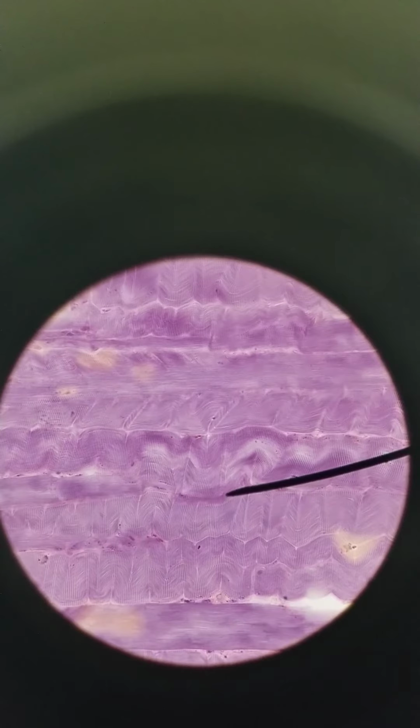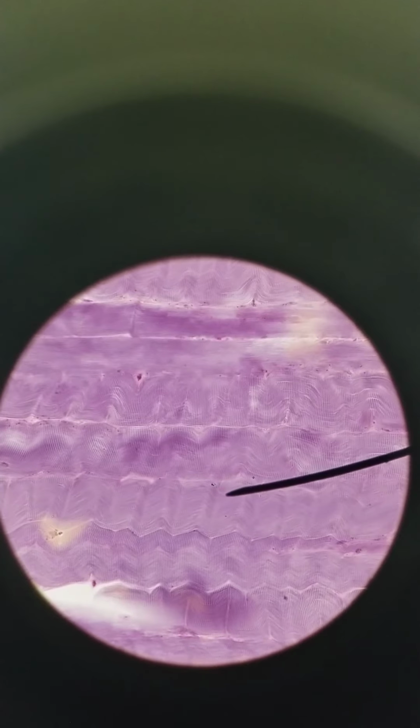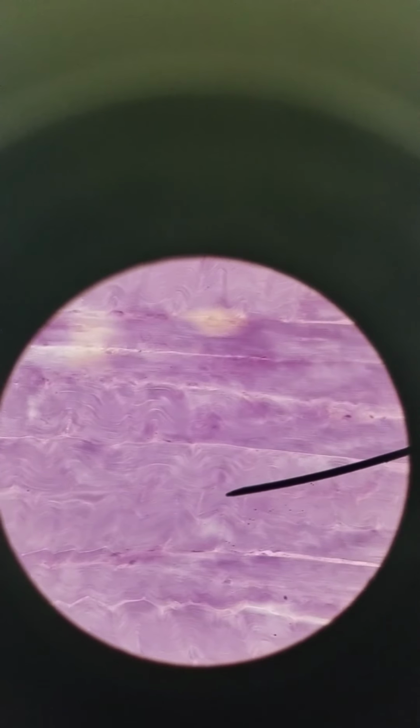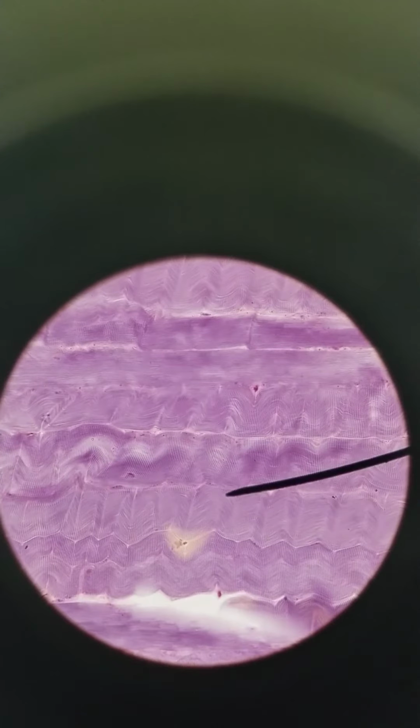An individual muscle fiber, so its sarcolemma, its plasma membrane, can extend really, really long. I'm trying to trace it. It's not perfectly straight. But this is the border between fibers, between cells. Really, really long fibers. They're that way because they started as myoblasts that then fused together to form a really, really long cell, which means if you have cells fusing together, these muscle fibers are going to have more than one nucleus. They are multinucleate.